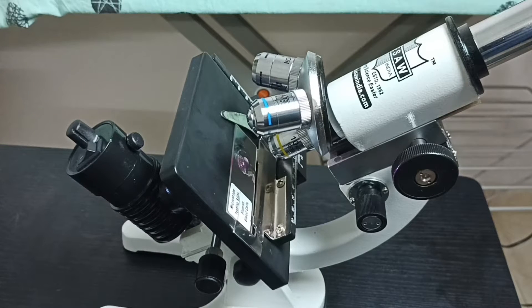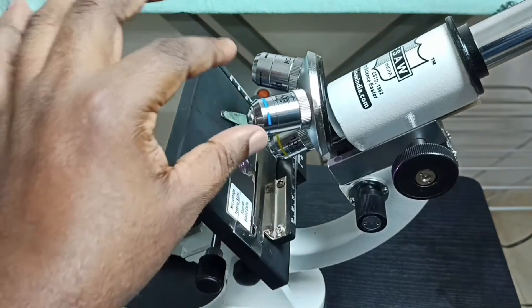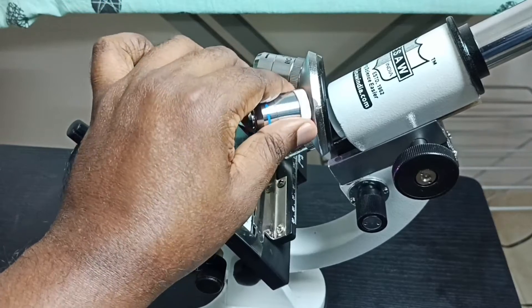Hi friends, this video shows how to clean the objective lens of a microscope. I'm going to clean this objective lens — first let me remove this lens from the microscope.